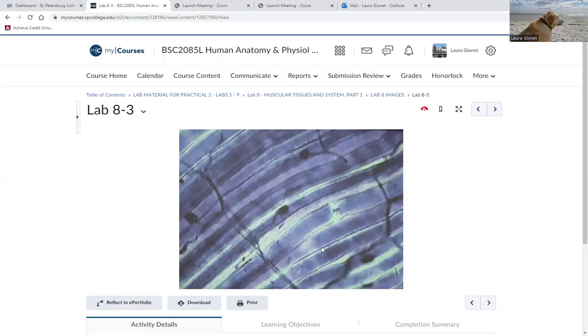Okay, then we have the neuromuscular junction here. The background tissue here is purple, but sometimes it's more of a red color. That represents the skeletal muscle, because all skeletal muscle cells have to have their own nerve supply. Now, this black here that looks kind of like spider legs, those are the motor neuron axons. They terminate in these little round regions called the axon terminals. So it's kind of like their fingertips.